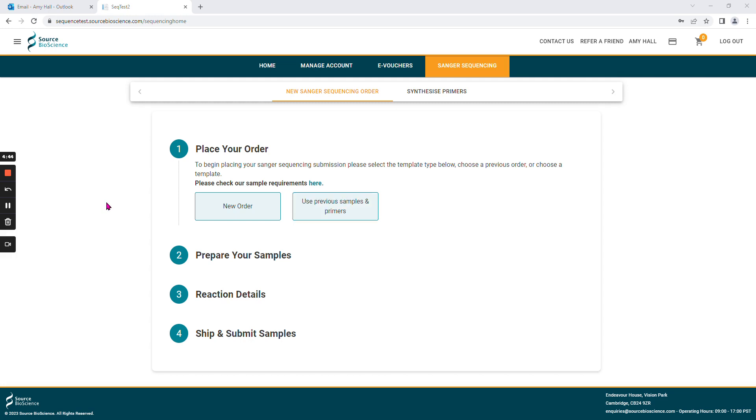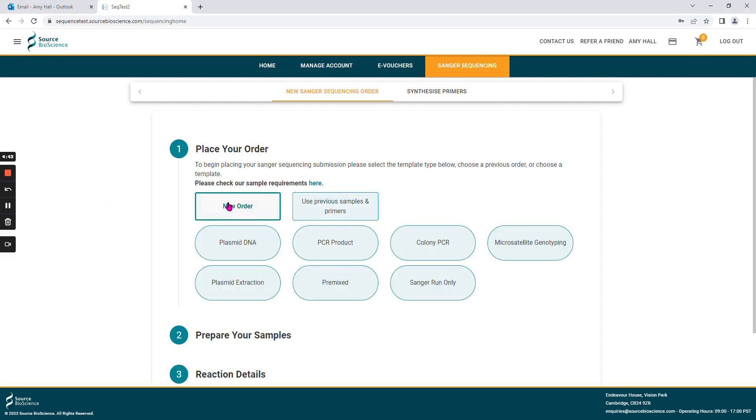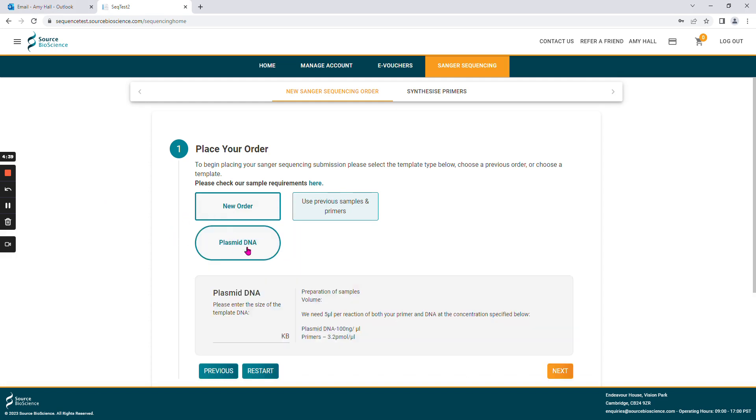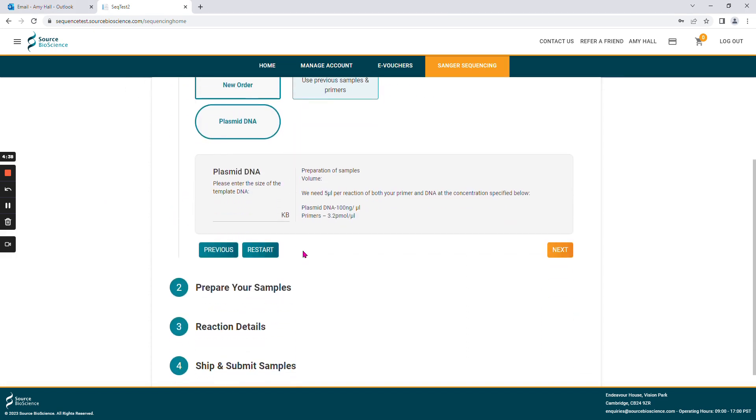Please select the option that you want and choose the template type that you wish to sequence. If you know the size of your plasmid, please input this in the box provided. However, this is not necessary if you do not know the size.